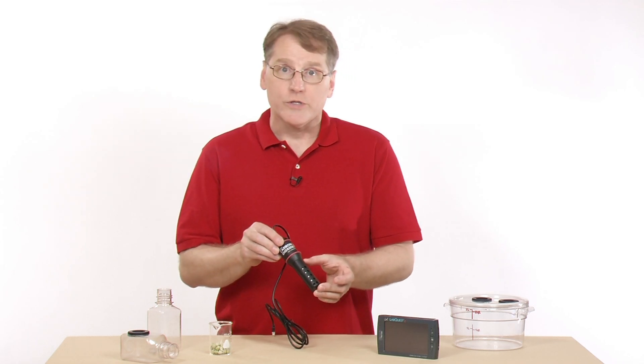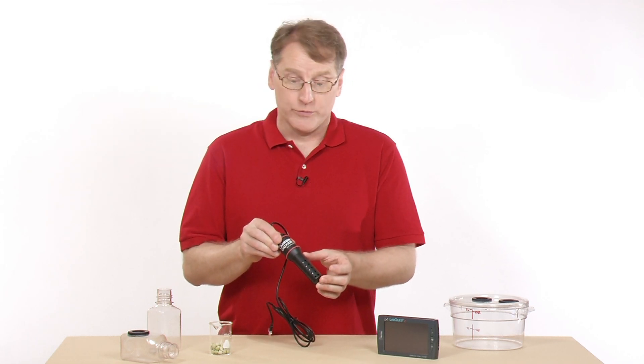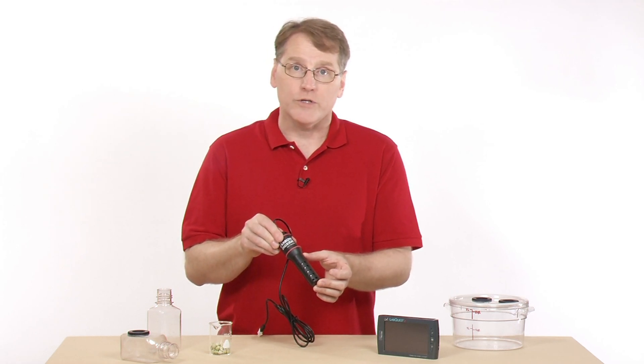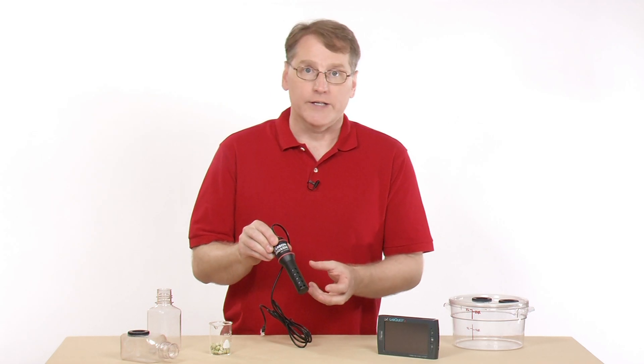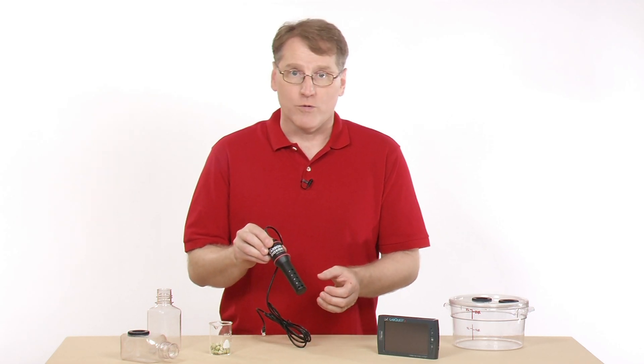Since this sensor uses an IR source, you do need to let it warm up for 90 seconds when you use it. When you plug it in, it will not give you a correct reading until it's ready for collection.